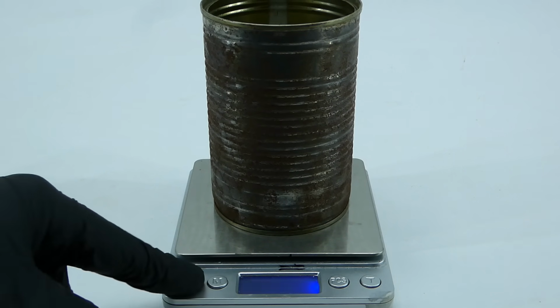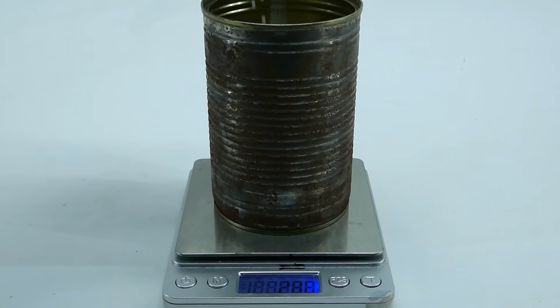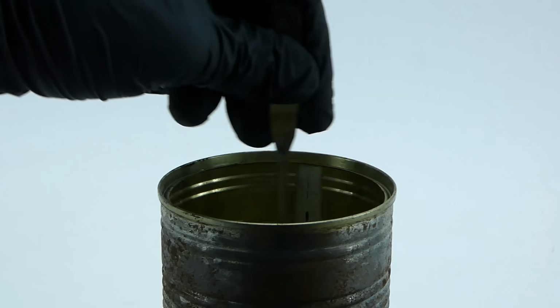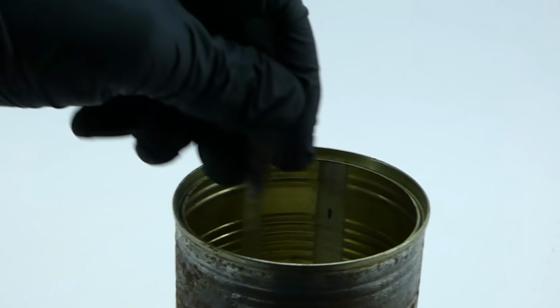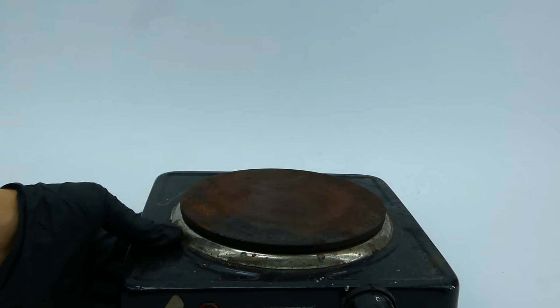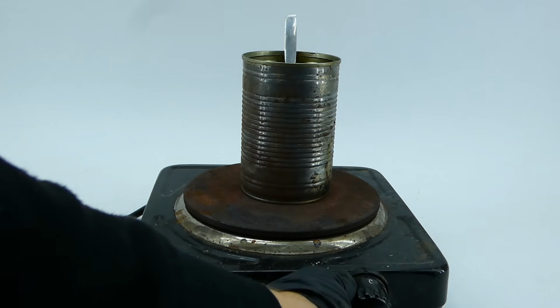After cleaning it up, I poured in 140 grams of my sand, followed by 80 grams of sodium hydroxide, and mixed them thoroughly using a metal spatula. I then got my rusty electric stove, placed the can on it, and cranked up the heating.